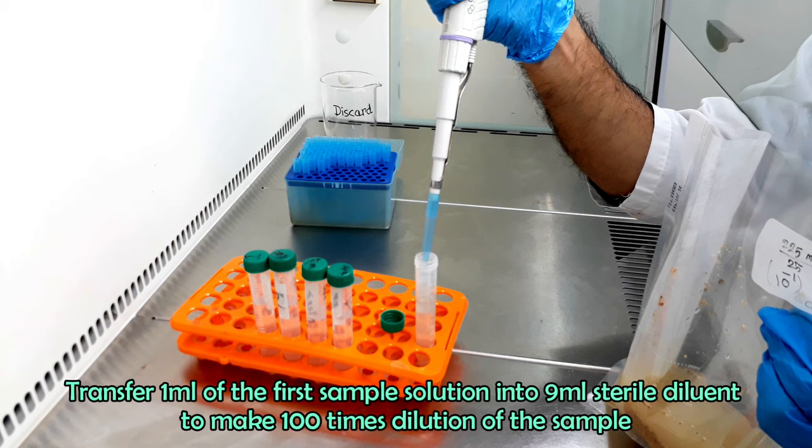Now we will isolate bacteria from each dilution by pour plate method. Bring sterile petri plates. We will use two petri plates for each dilution. One plate is for trial 1 and another one is for trial 2. Label each plate. These two plates are for the dilution 10 inverse 1.